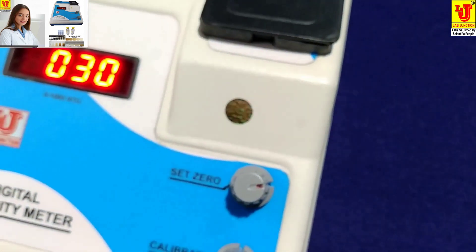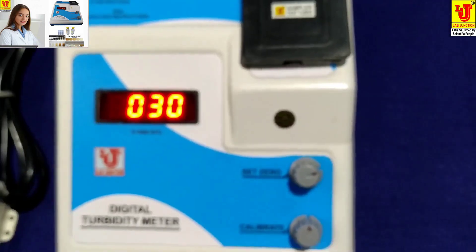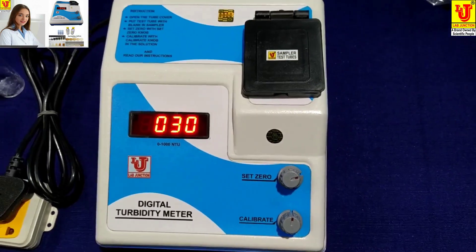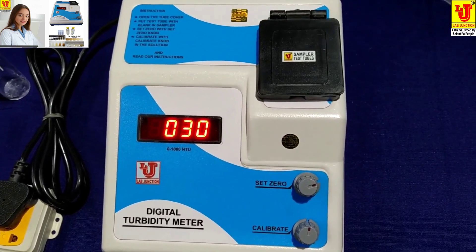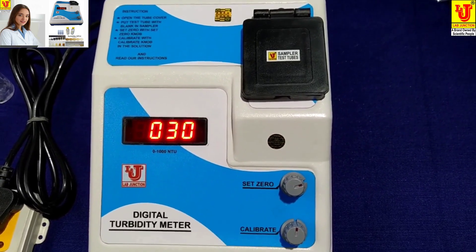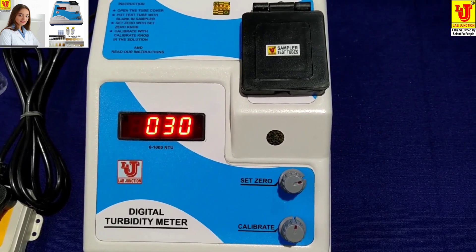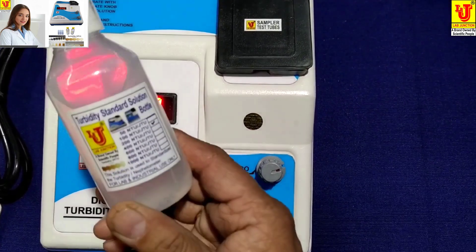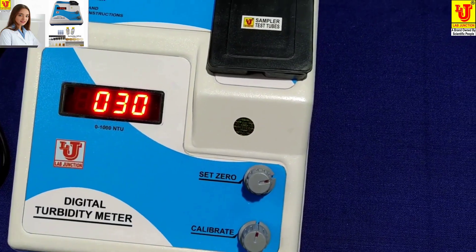Now we will start the operation for the testing. This digital turbidity meter has a range of 0 to 1000 NTU per JTU. Now I am taking the 100 NTU per JTU solution for calibration.